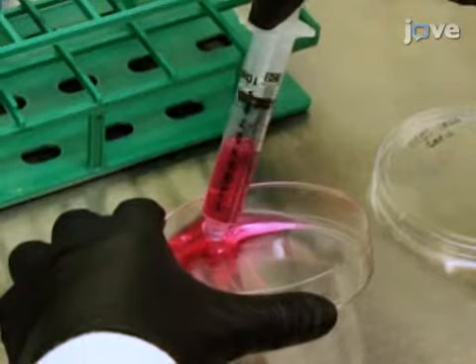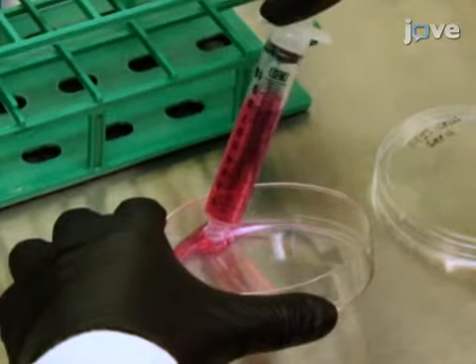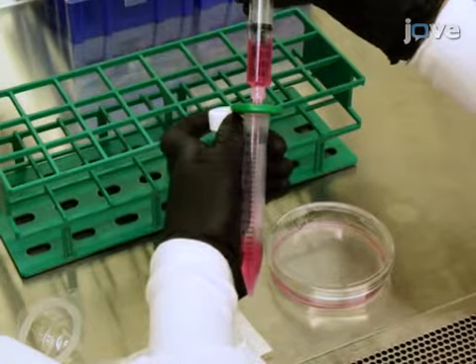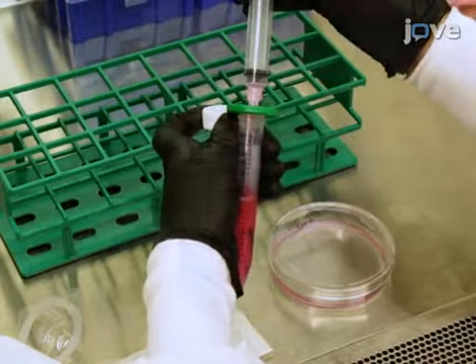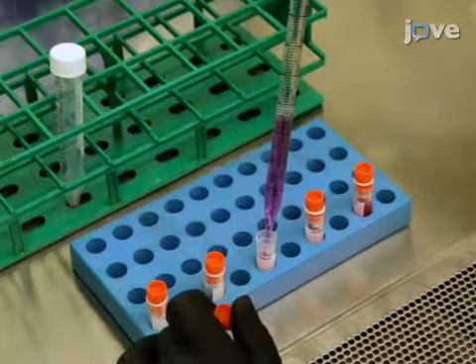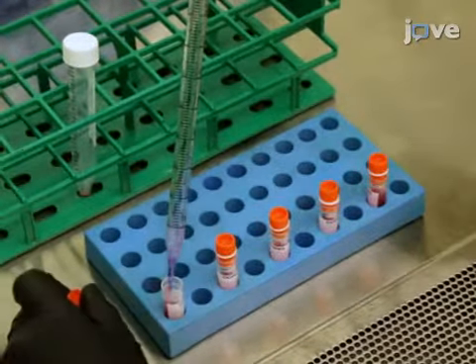Harvest the virus-containing supernatant after 24 and 48 hours by passing it through a 0.22 micrometer filter, and aliquot 1.6 milliliters of supernatant in each cryovial.